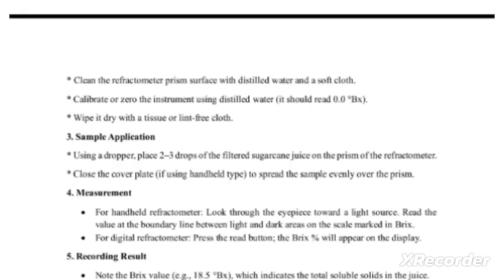Use of Brix in sugar industry. Estimate sugar yield. Monitor juice concentration at various processing stages. Determine cane quality for farmer payment. Optimize evaporation and crystallization processes.